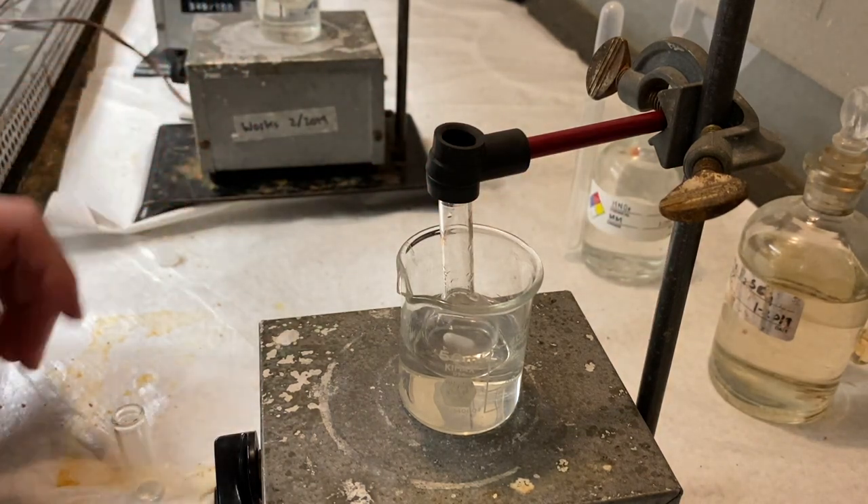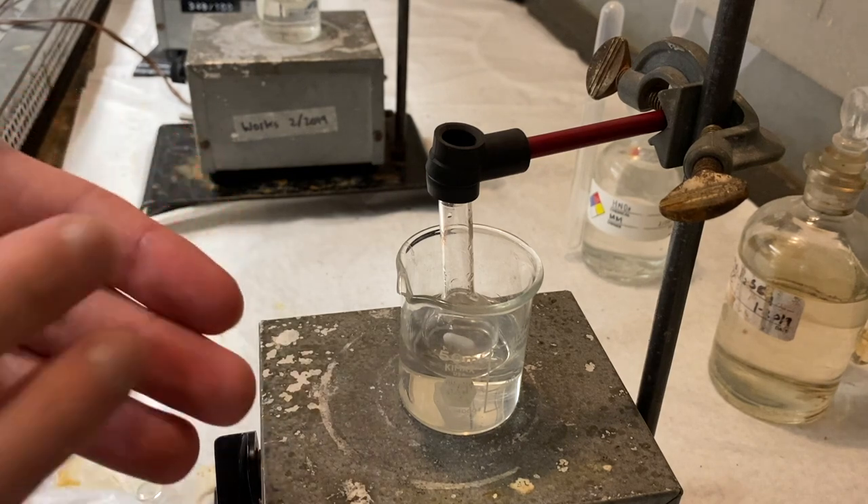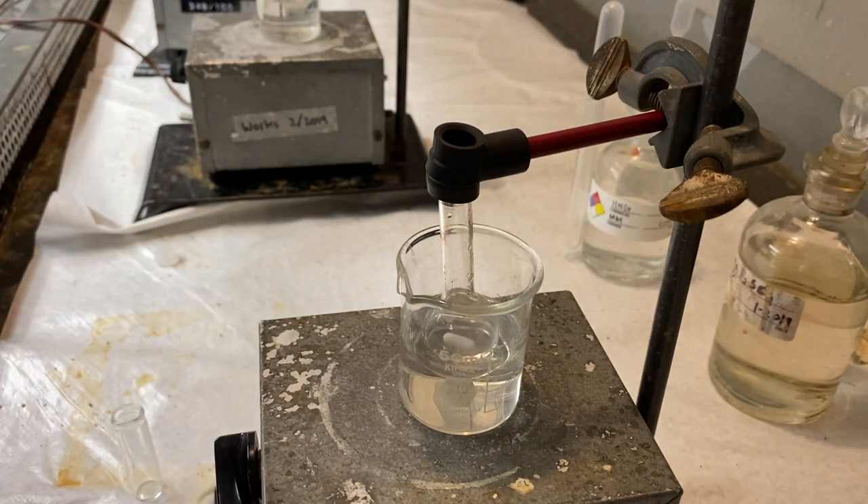If you get the nitric acid on you, your skin will turn a little bit yellow. If you get the sulfuric acid on you, it'll probably turn a little red because it burns you a little.